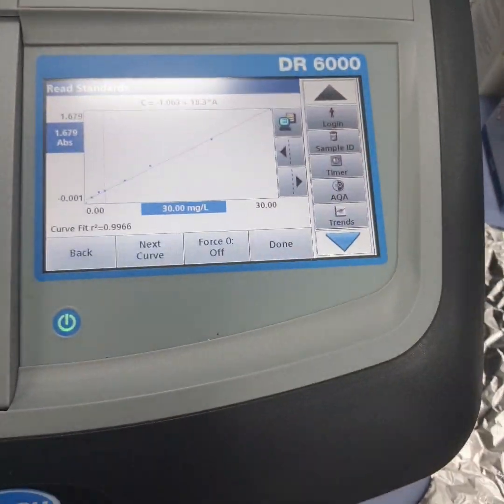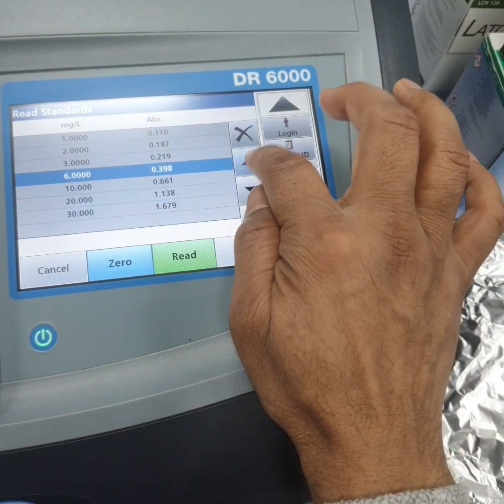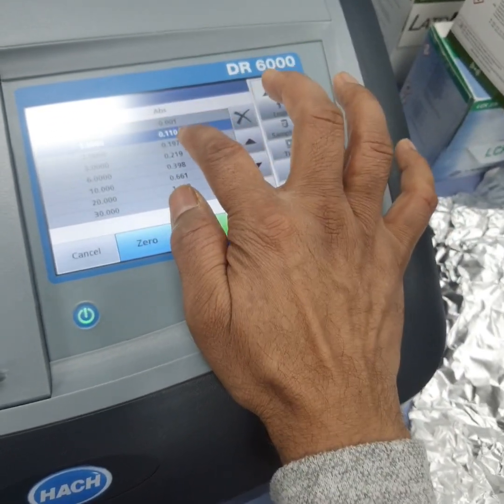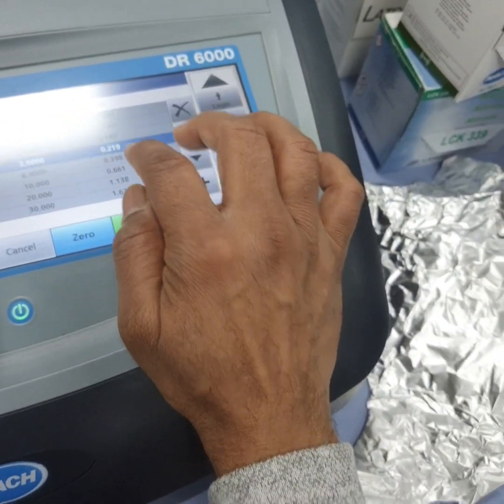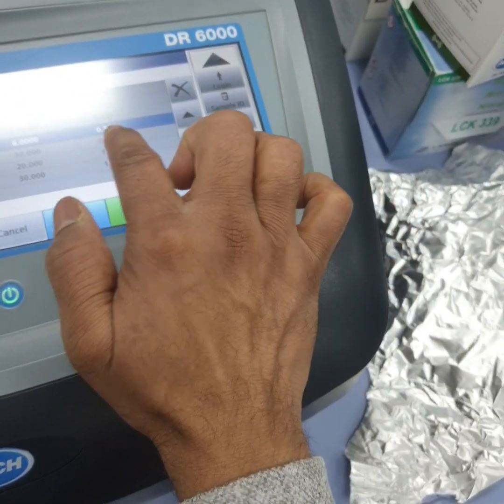Okay, now let's check the calibration. So it's showing 0.9966. Let's go back and identify the points which are wrong. Okay, we may delete. So this is what? How much? 0.11. This is double, and this is not. I mean triple. So we can delete it.